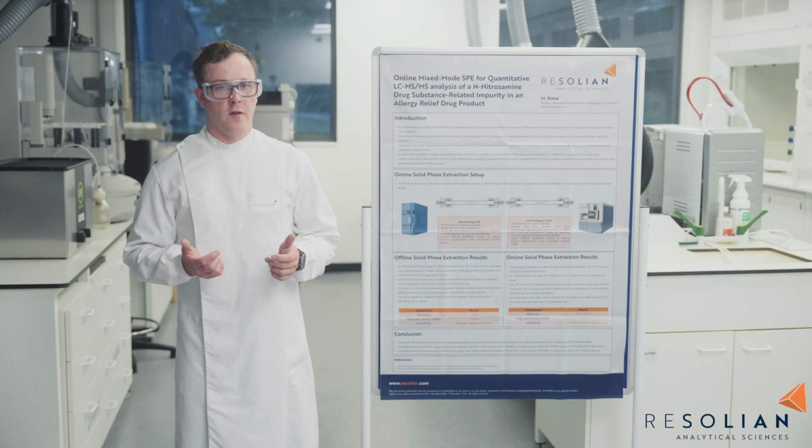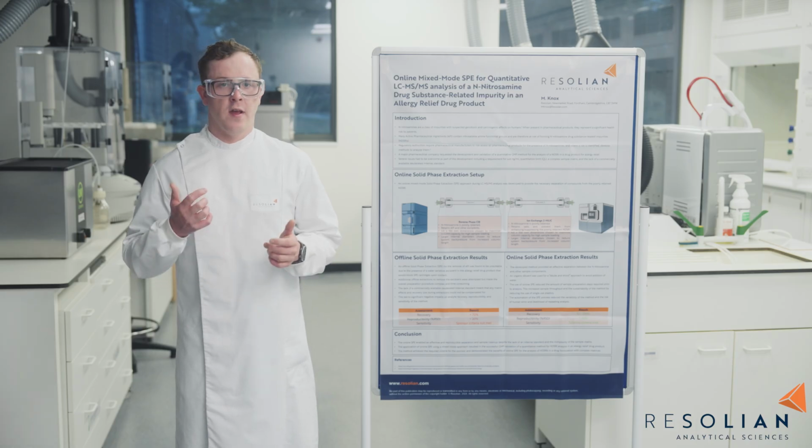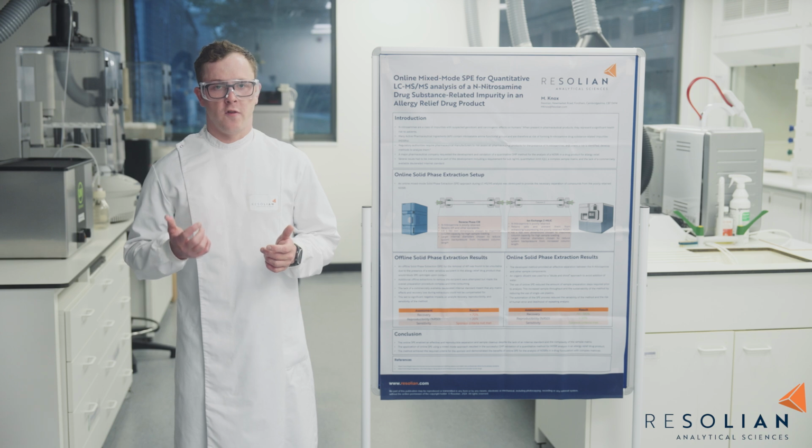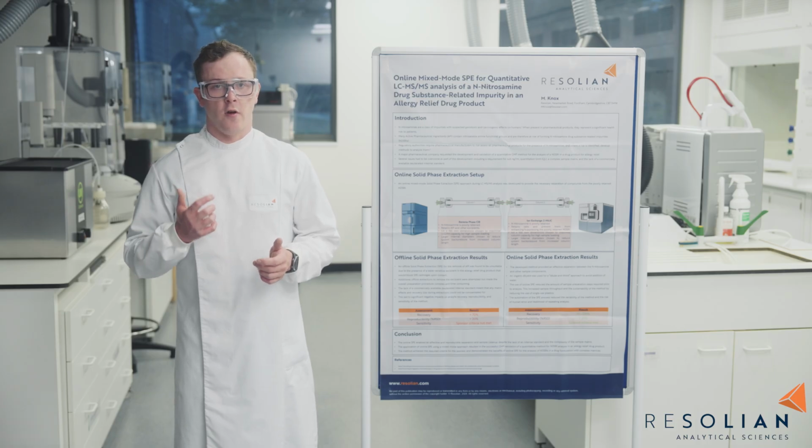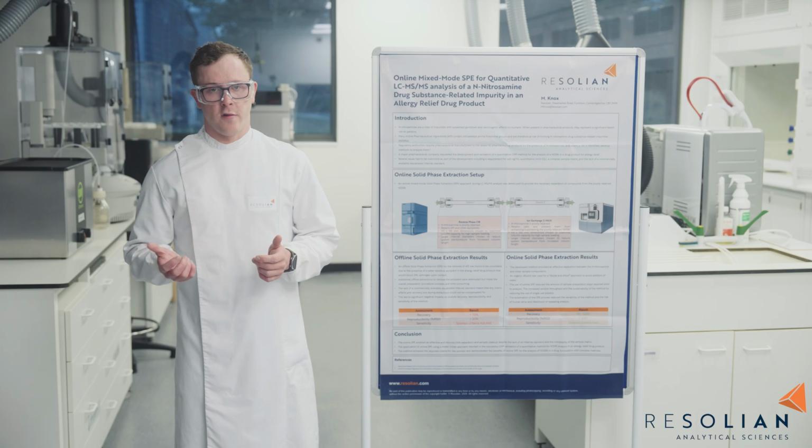Several issues had to be overcome in this development, including the requirement for a sub 1 nanogram per mL quantification limit, a complex sample matrix, and a lack of a commercially available deuterated internal standard. The initial challenge was the separation of the analyte from the API itself. An analytical method had previously been developed at Resolian for quantitative analysis of the same nitrosamine in other drug products that contain the same API.